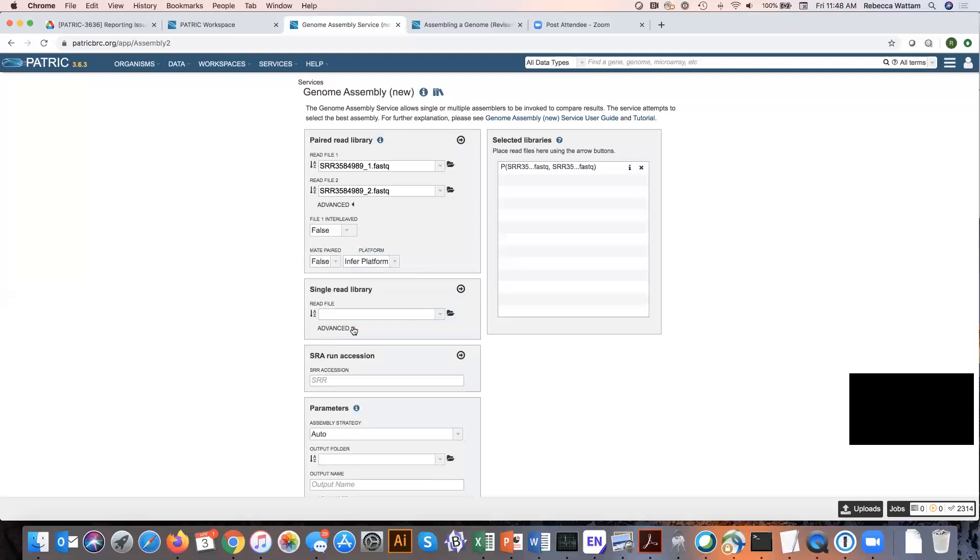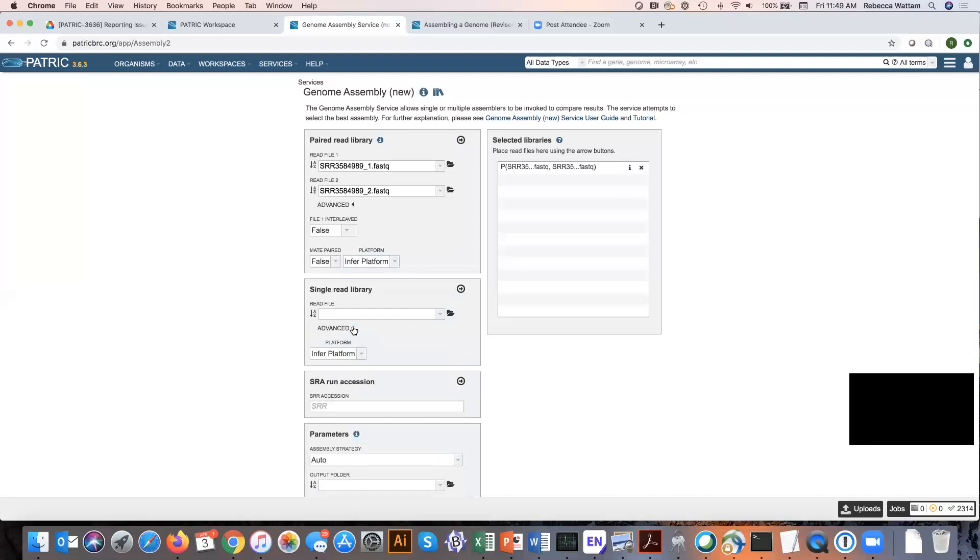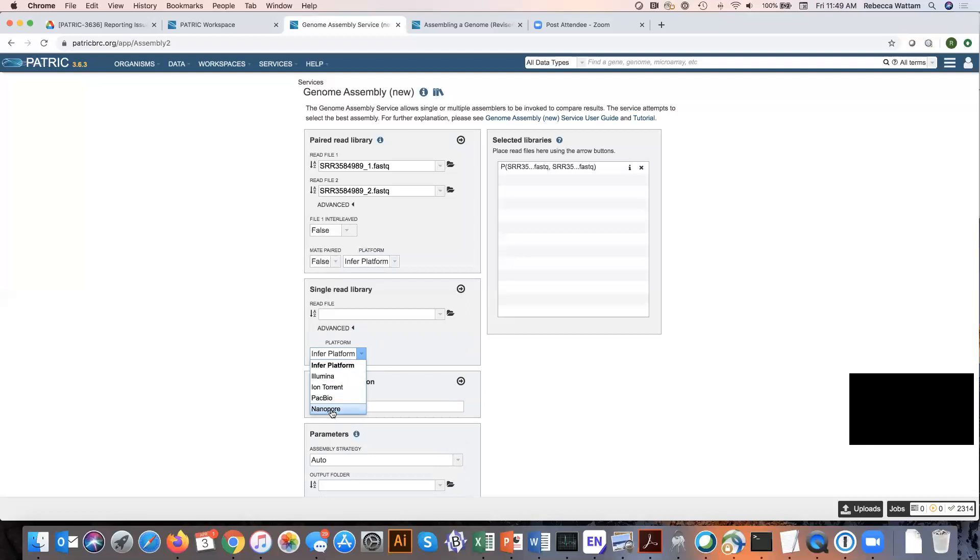If you had a file there and you click on Advanced, and let's look at Platform, you notice that you could have single read Illumina, single read Ion Torrent, or the long read PacBio or Nanopore that you could add.